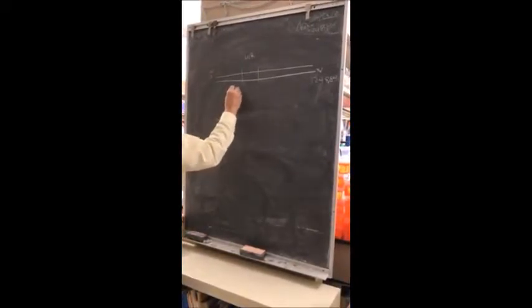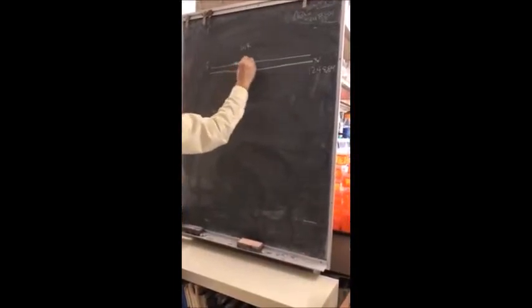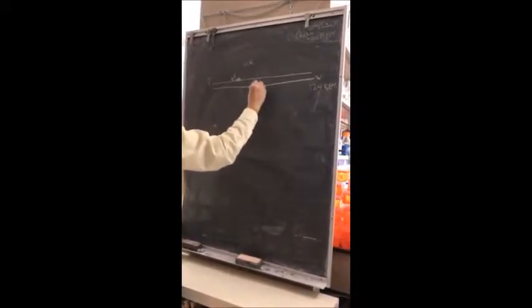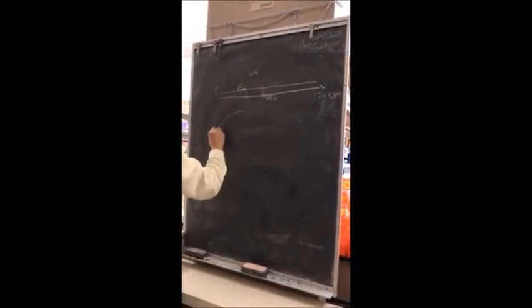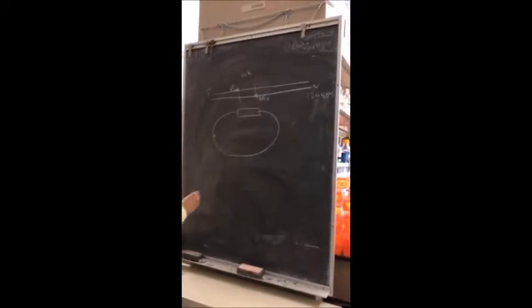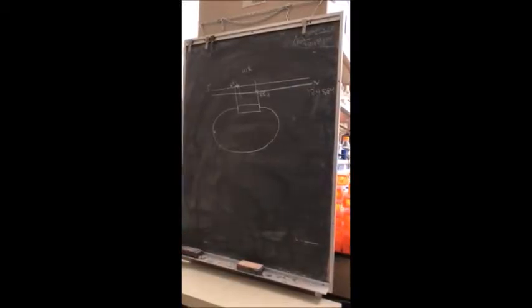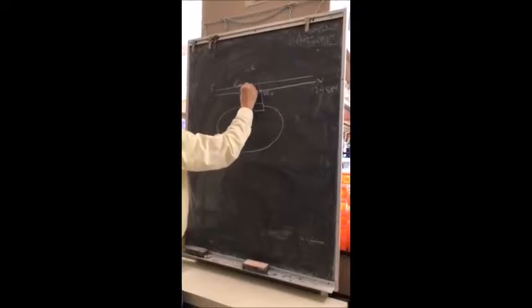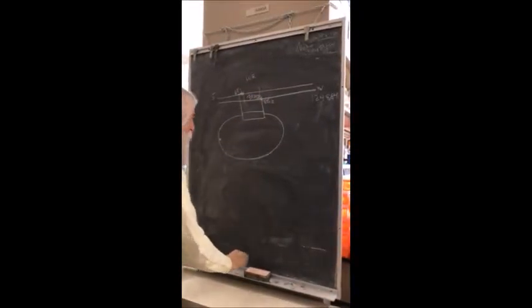All right, so what we've done first is we've generated a PCR primer that would amplify this region, and we put a restriction enzyme site on both sides. And they're different so that it can be cloned directly into a plasmid at the comparable restriction enzyme sites. All right, but we've had a problem amplifying this 4 kb fragment for one reason or another.